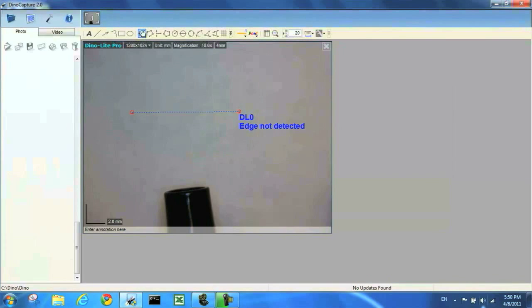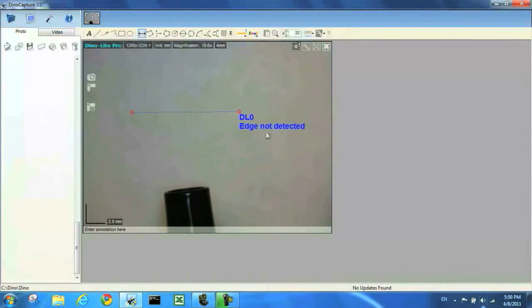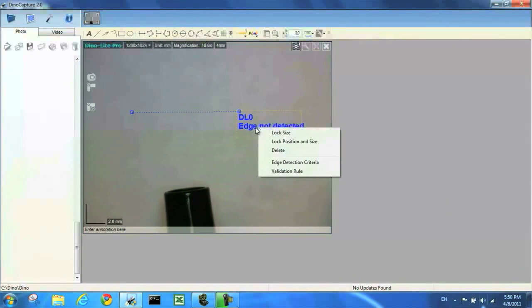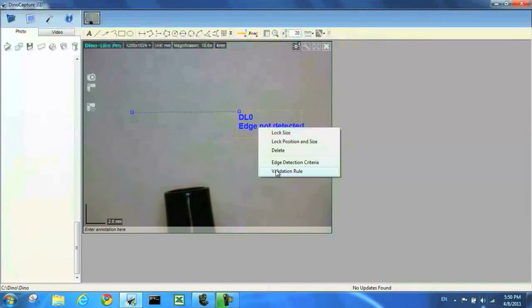Now I'm going to click out of the line measurement tool and right click on my results box here to open up the validation settings.